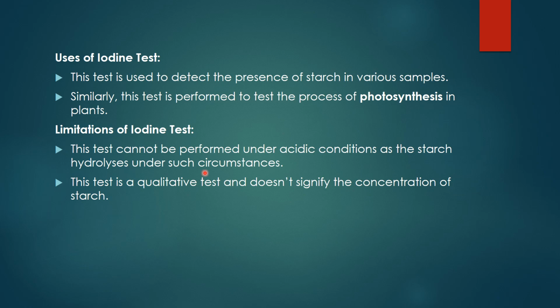This test is a qualitative test, just to detect if there is starch or not, if there is glycogen or not, but it does not signify the concentration of starch. You cannot determine the concentration of starch or even a certain polysaccharide. You just detect if it is present or not in the sample, because it's a qualitative test.